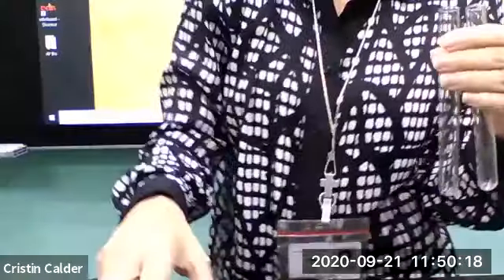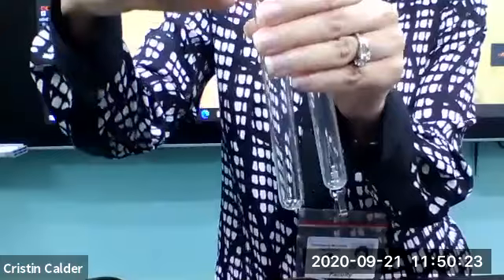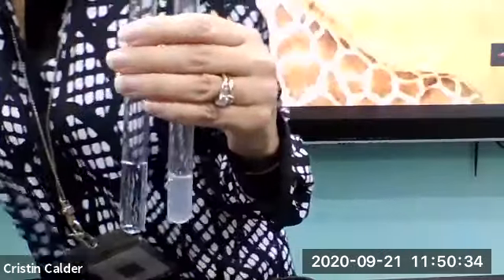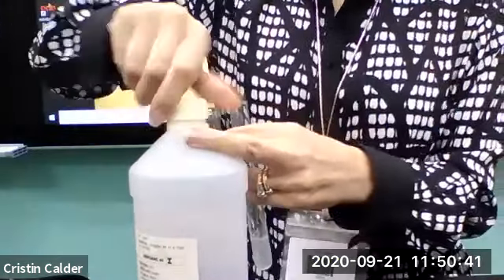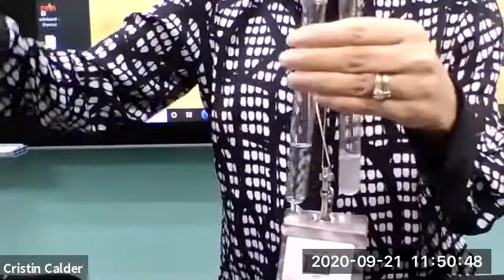So to test for protein, I have some protein solution that I mixed up here. And in my other test tube, I'm literally just going to put some water again. So here's my water here. And then my indicator this time is Biuret solution here, Biuret. And so I'm going to put a little bit of this in each. And then you're going to see the difference between a positive and a negative test for protein.